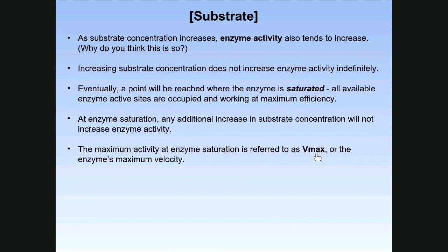So the last pre-lab questions actually have to do with the first part of the lab procedure, and it's setting up a serial dilution. If you look at table 1, going left to right across the table, notice the concentrations of substrate that you're going to be giving to the enzyme have a difference of 2-fold. And I'll let you figure out what I mean by that from there.